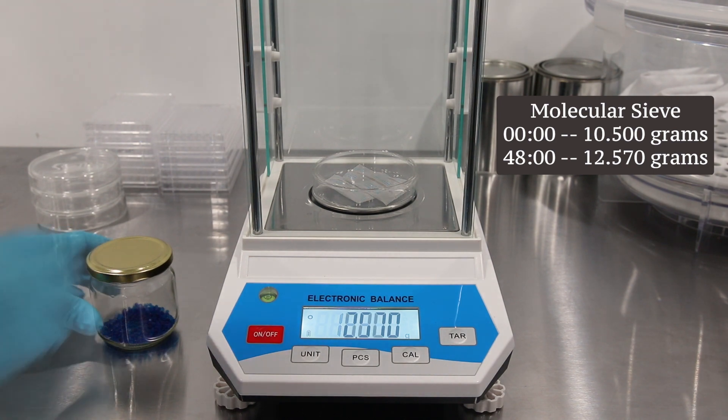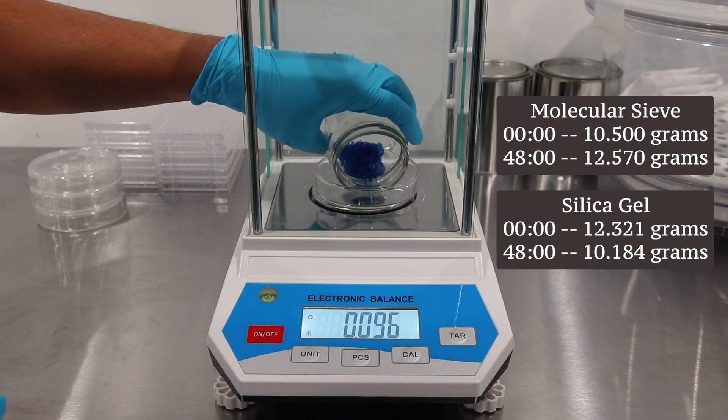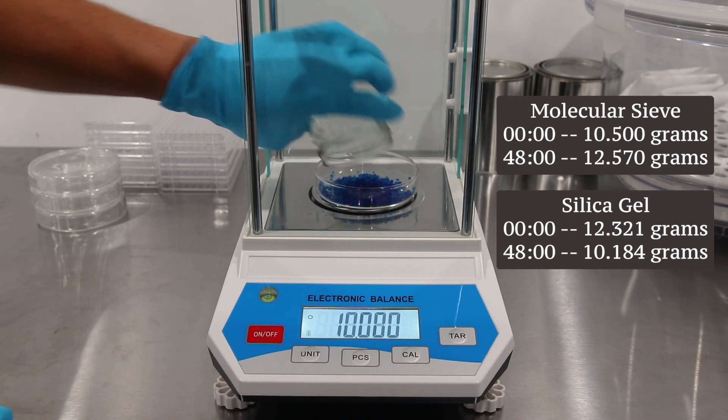The molecular sieve packets have a final weight of 12.57 grams, whereas the silica gel weighs 10.184 grams at the end.